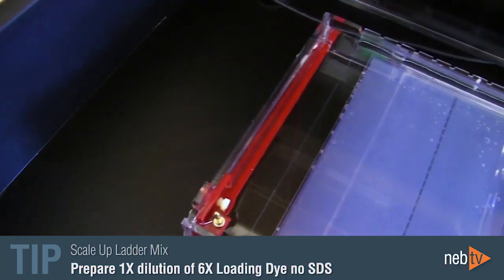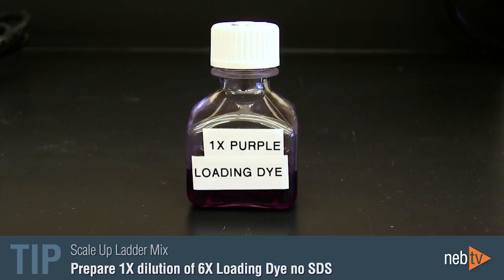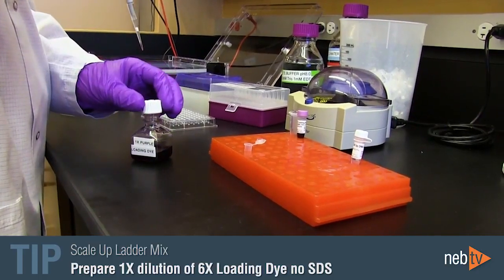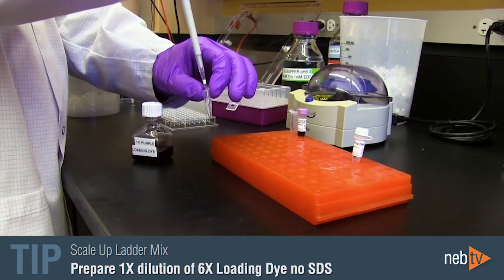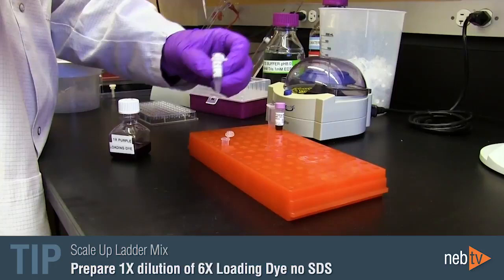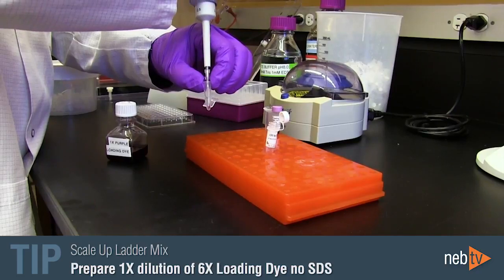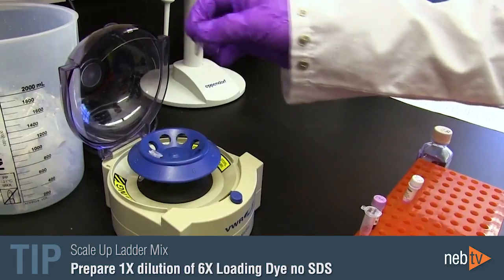The DNA ladder mix can be scaled up if you need to load multiple gel lanes. Simply prepare a 1X dilution of the 6X purple loading dye — no SDS — in advance by diluting it with water. For each gel lane that you'd like to run, add 5 microliters of the 1X purple loading dye dilution into a microfuge tube, then add 1 microliter of the DNA ladder.